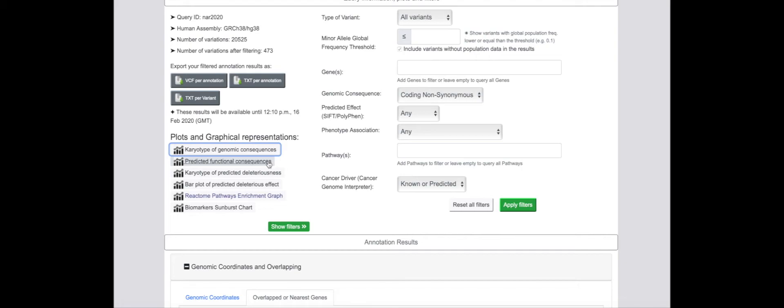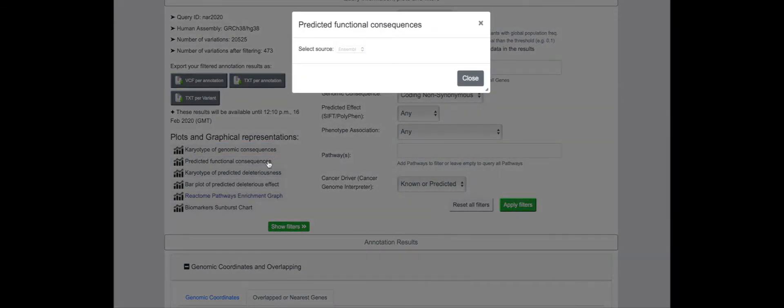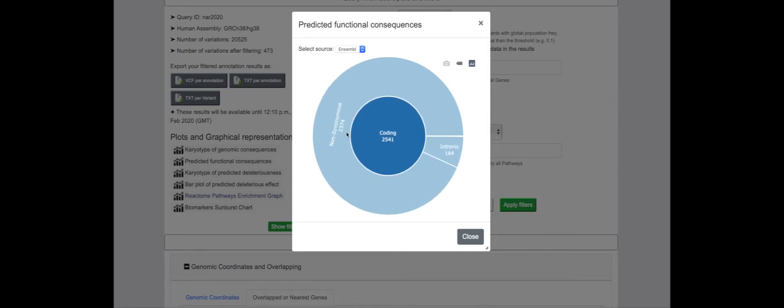The proportion of input variants bearing different functional consequences can also be easily viewed. In this patient, it's easy to see that most coding variants have a non-synonymous classification.